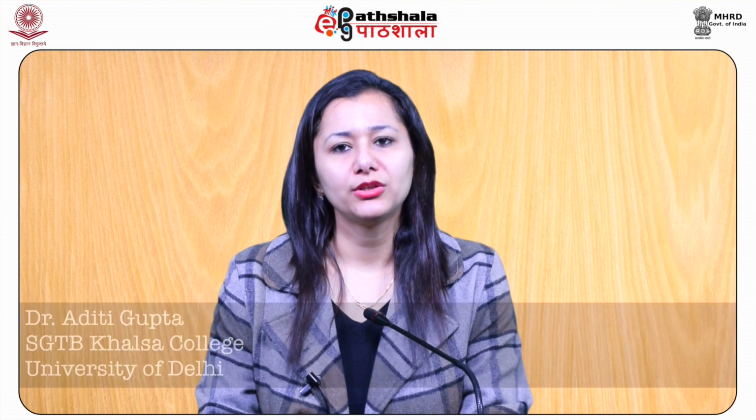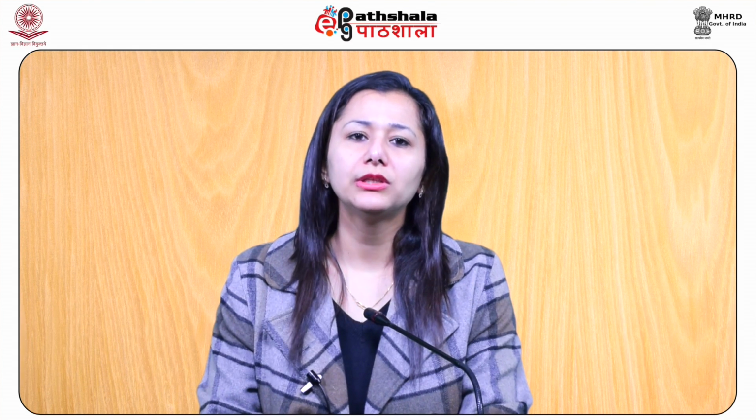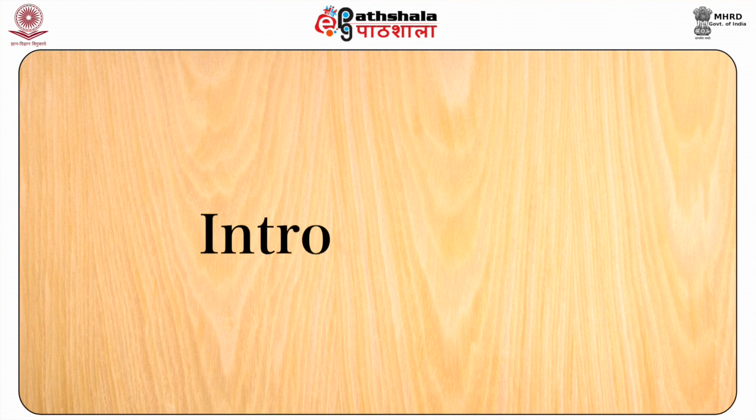After studying this module, you shall be able to know about the significance of nuclear magnetic resonance spectroscopy, the principle behind NMR spectroscopy, and the various scientific phenomena related with NMR spectroscopy.